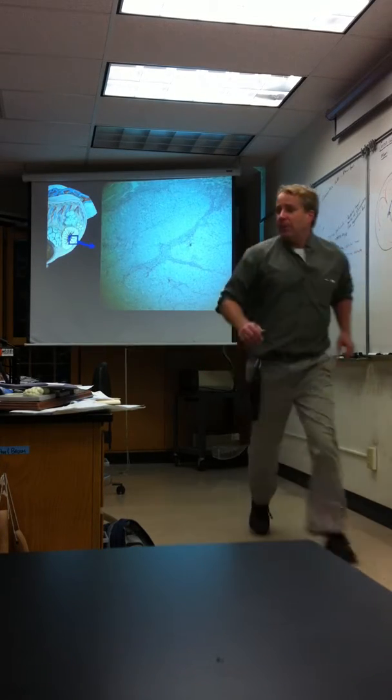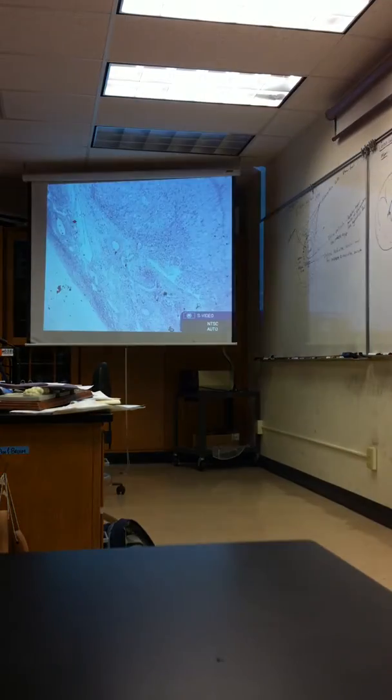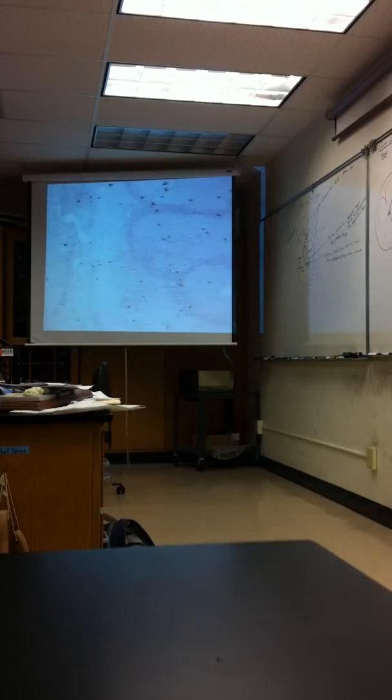And so let me just put on the screen my corpus luteum slide. And so this is, the specimen says corpus luteum. But what is, and you could definitely be asked, what is the organ that we're looking at? Ovary. It is the ovary. Good. So you don't want to forget that the corpus luteum lives within the ovary. So we're looking at the ovary. The outer edge would be the germinal epithelium. And so this is all ovary.